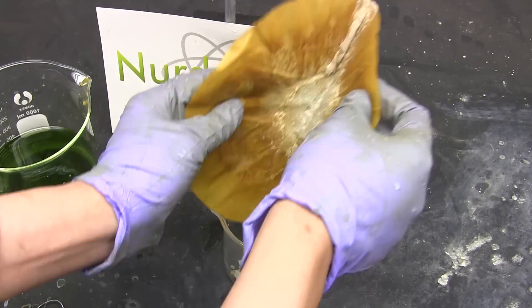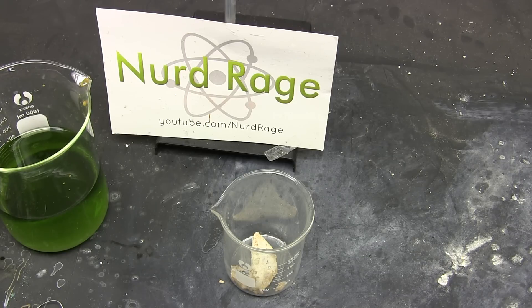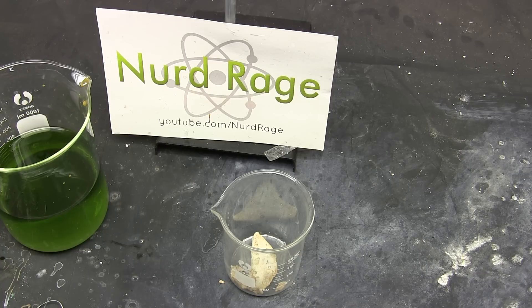Once everything is filtered retrieve the residue of copper 1 chloride. And there you have it, separation of the iron from the copper. Now we need to convert the copper chloride back into the copper metal that went into it.